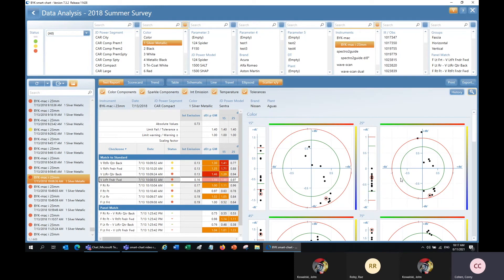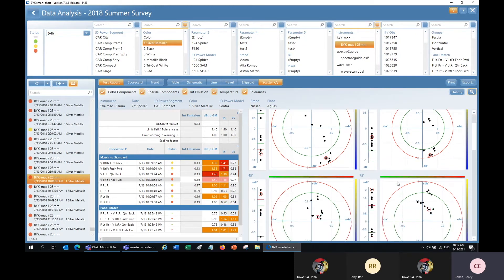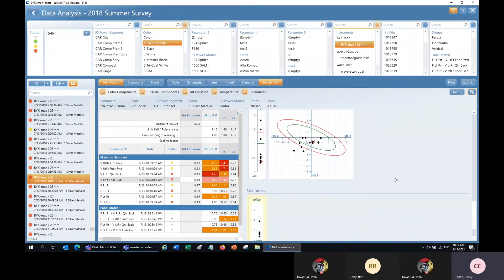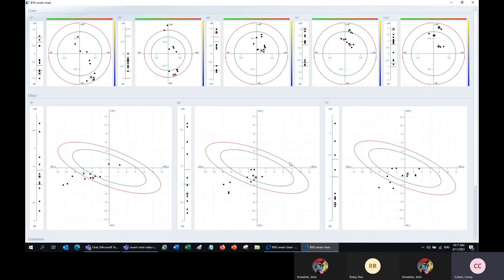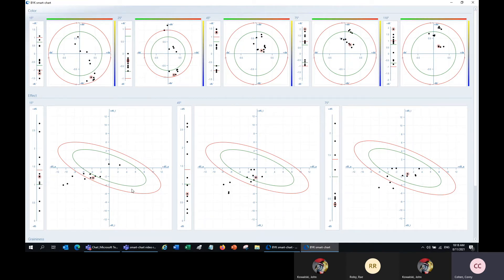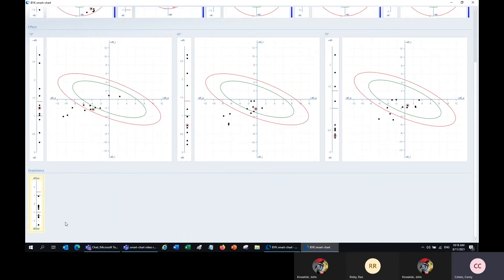In addition to graphs for color, we can also view graphs for our effect measurements — the sparkle and the graininess — which you can see down here. Here we can see the sparkle intensity and sparkle area graphed for each check zone, with green and red tolerance shapes. Over here to the left, we have our overall delta sparkle with red and green bars indicating in or out of tolerance. We have graphs for each measurement angle for both sparkle and graininess. These effect measurements are very important because they can have a huge influence on the color as well.